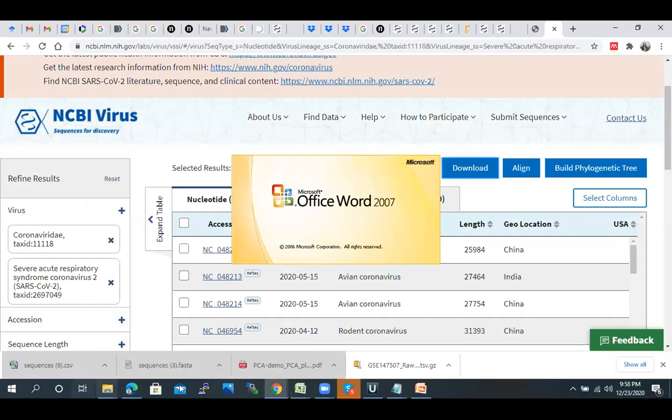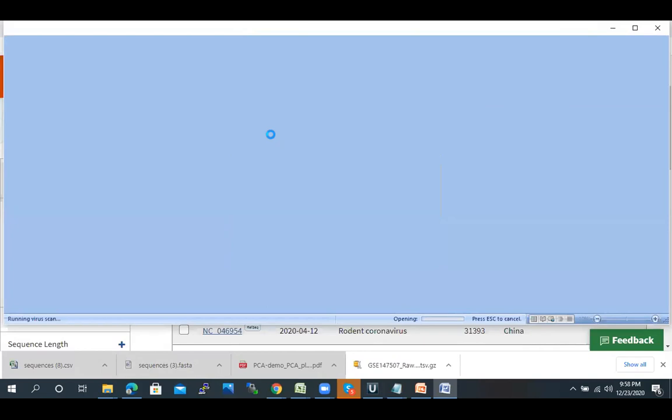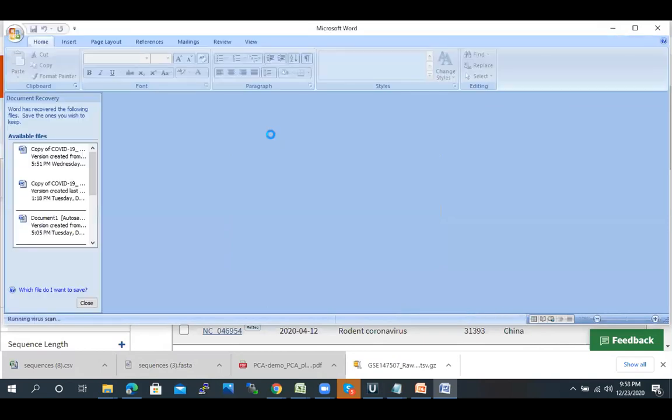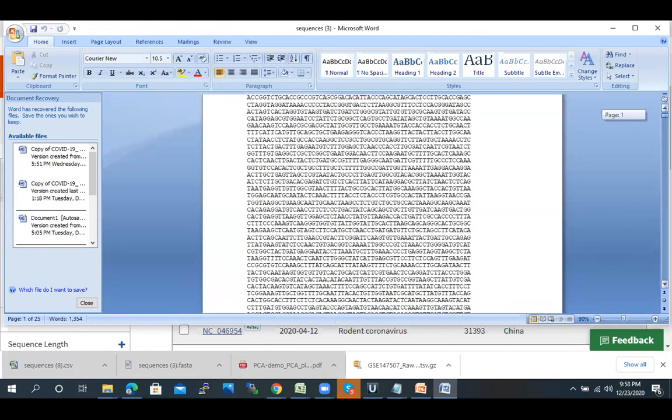I'm opening this file in this doc file. So these are the FASTA sequences.